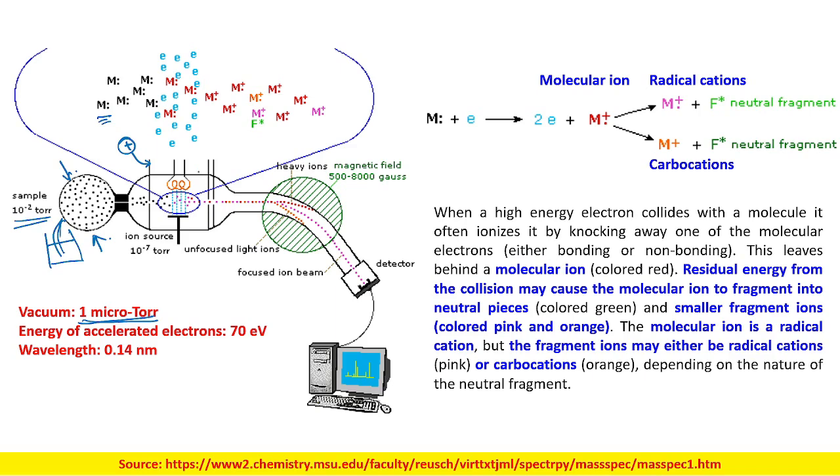However, as soon as you get into this section where the ionization is taking place, these molecules are entering a zone where you are continuously bombarding the section with electrons, and as we get out, we get different fragments.